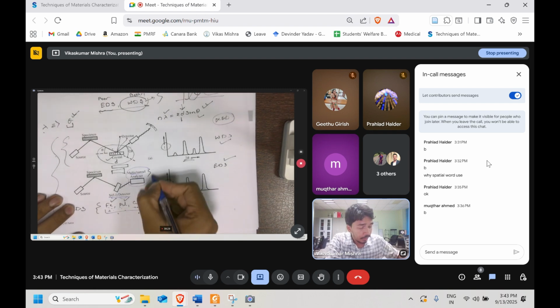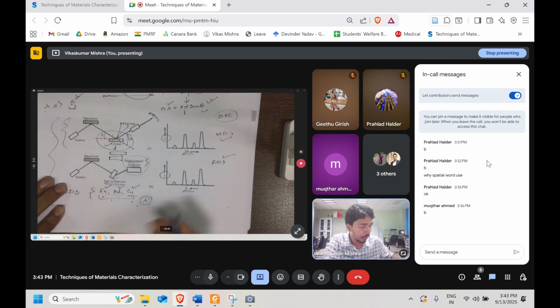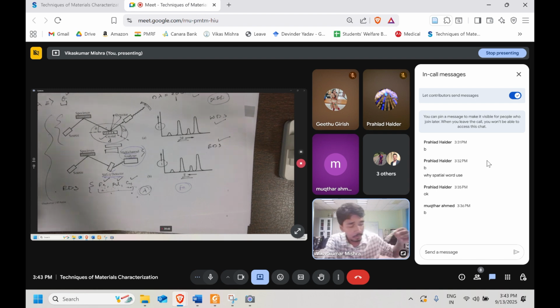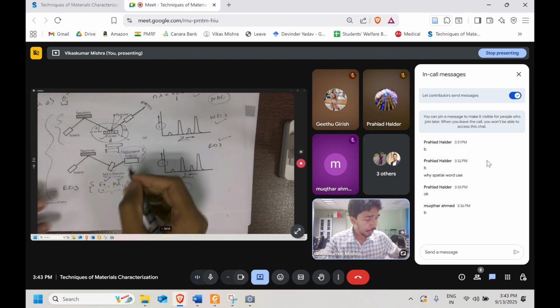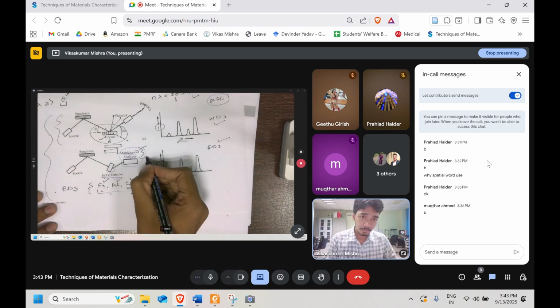Here, the multi-channel analyzer is there. Depending upon the energy that the X-ray has, and depending upon the number of electron hole pairs it generated, it will go to the multi-channel analyzer. For example, we have the periodic table, right? The multi-channel analyzer knows how much current should be produced for the iron and how much current should be produced for the copper. Based on the amount of energy and the electron hole pairs generated, it will try to analyze it. So this is a multi-channel analyzer. Within one go, within one cycle, you can complete this.